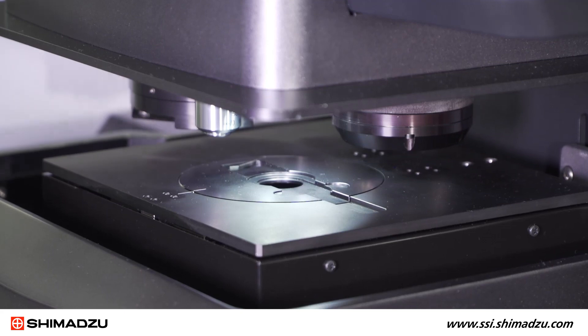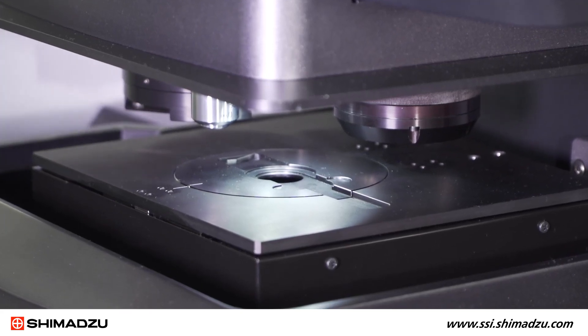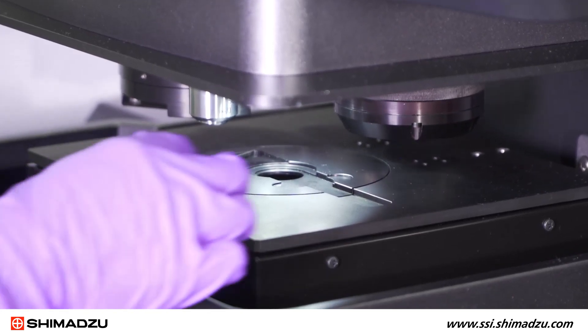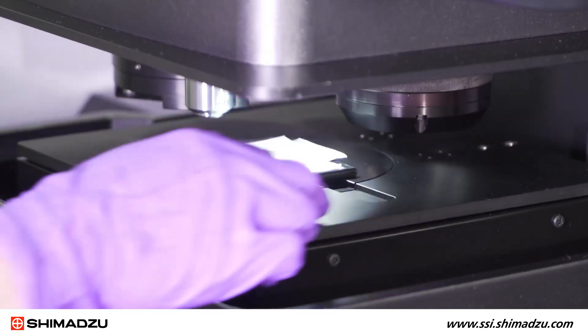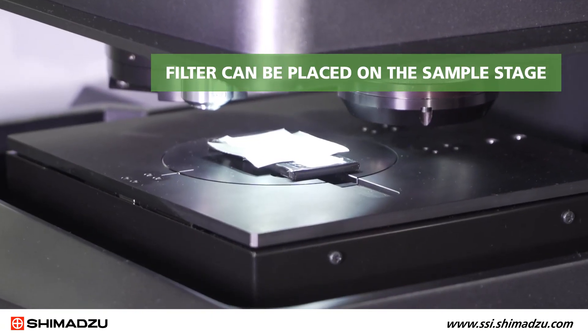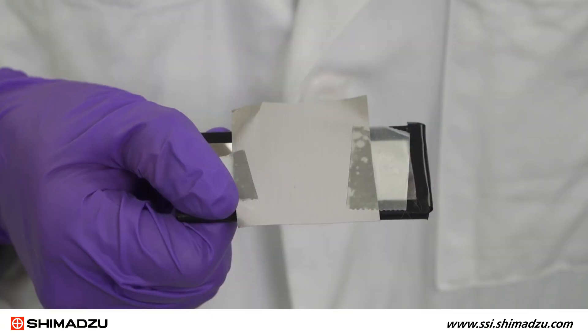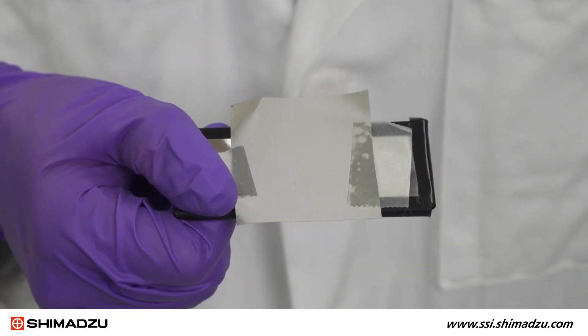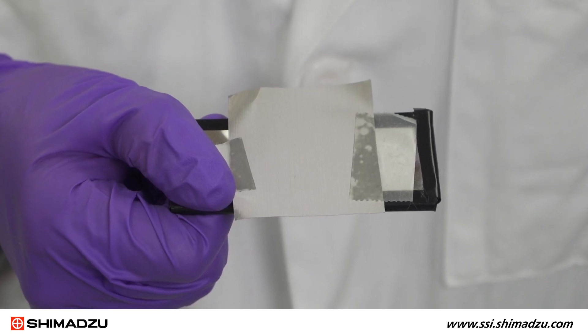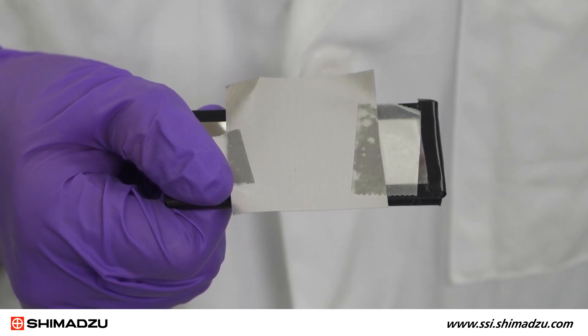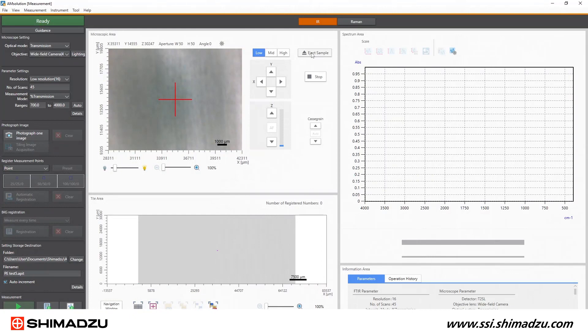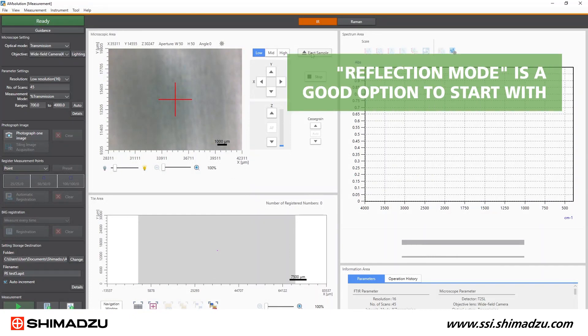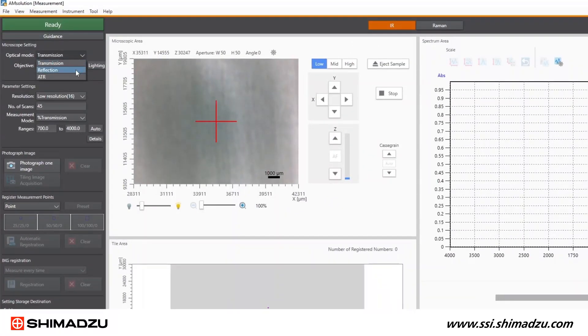Microplastics will most likely be stuck to the filter that was used during preparation. After thoroughly drying the filter, it can simply be placed on the sample stage. I have the filter secured to a mirror to ensure the sample is flat and increase reflection back to the detector. Since the filters are generally not transparent in the infrared region, reflection mode will be a good option to start with. Select reflection measurement mode from the dropdown list.